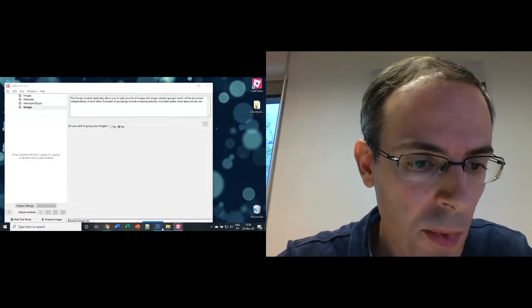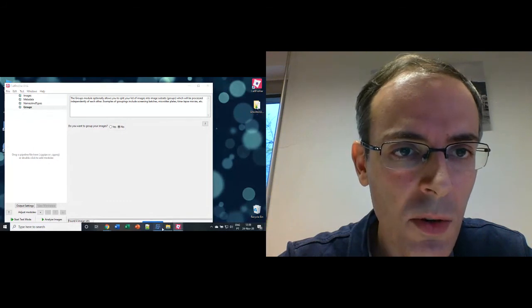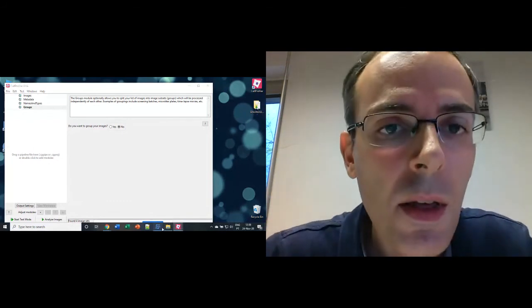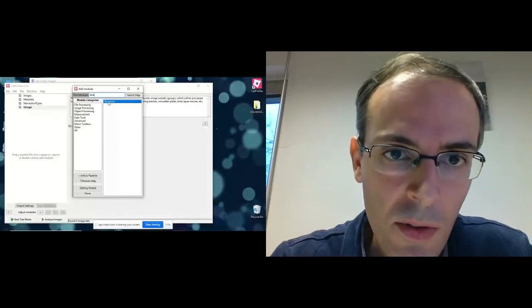You can also click this plus button, which lists the same information, with the exception that you can actually write here the name of the module. So let's add the threshold module.